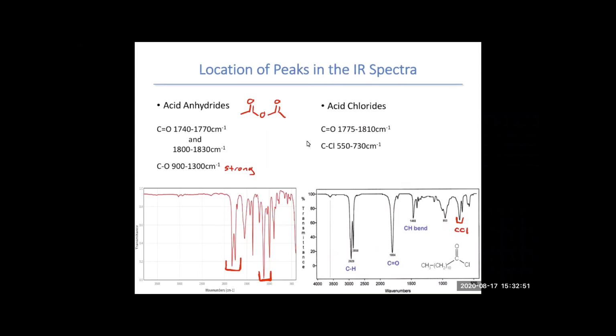And so it's having that unusually high carbonyl that is a distinguishing factor for our acid chlorides. Even though we really just look for the carbonyl, if it's a really high frequency, around 1800 or higher, that tells me I have an acid chloride over a ketone. If I have just a carbonyl around 1700, then I would say it's a ketone.